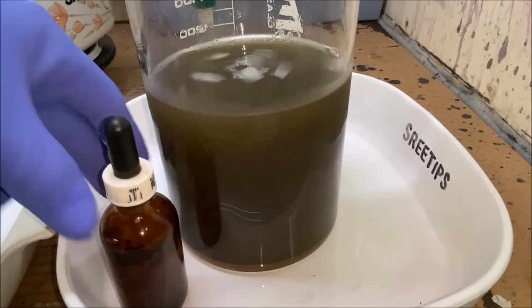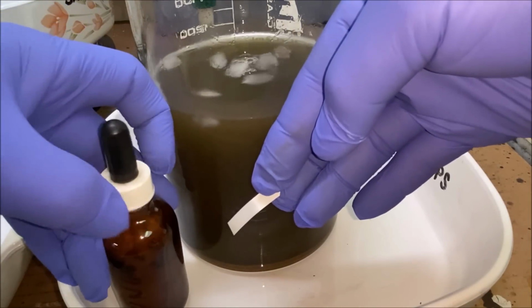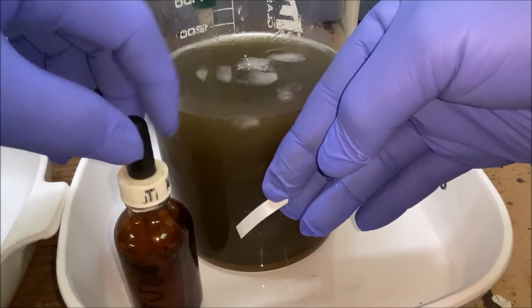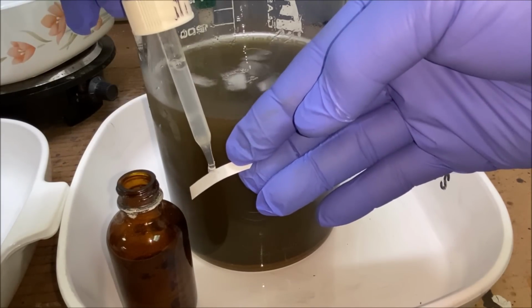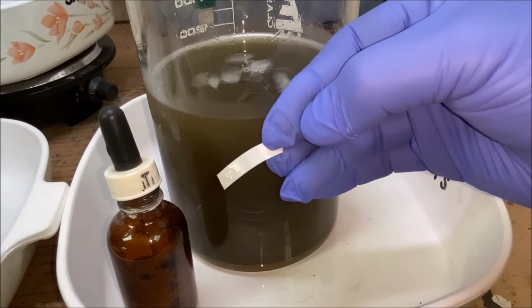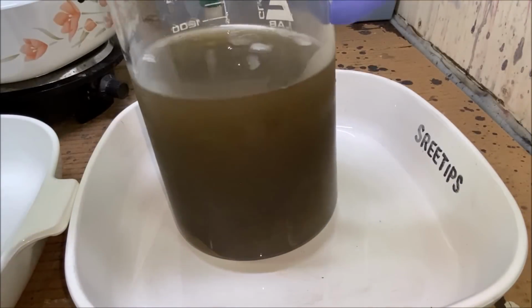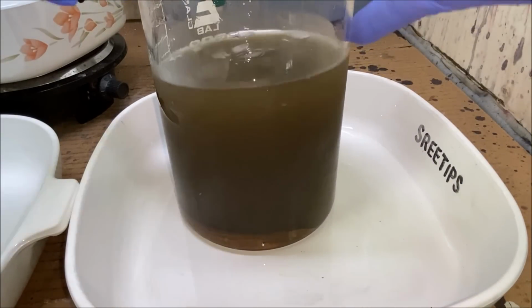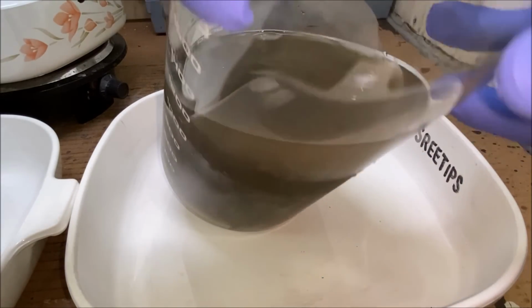Reach in for another stannous test here. This should do it. If there's still gold in there, I'll be surprised. Yeah, everything's out of solution now. All the gold has been precipitated. Oh yeah, we got a pretty decent amount down there. Does not look like 3 ounces though.